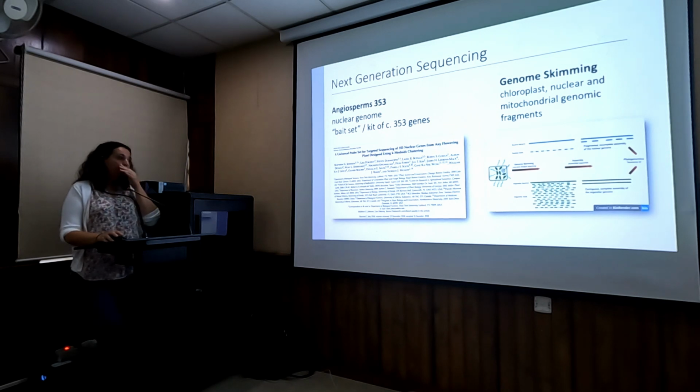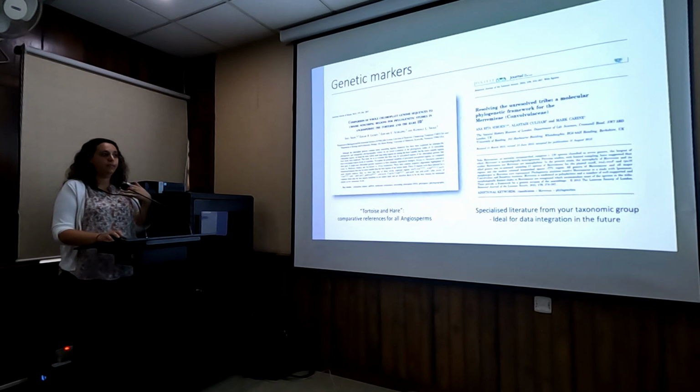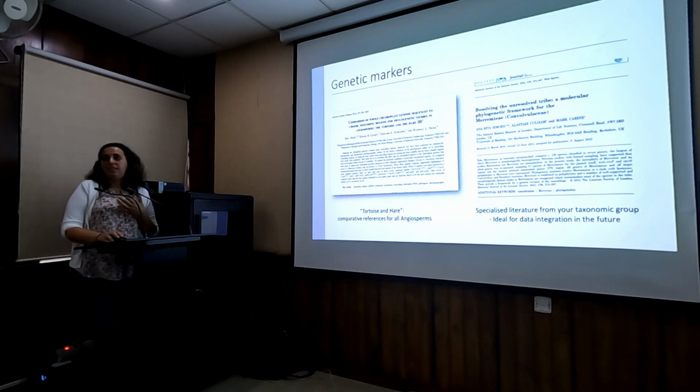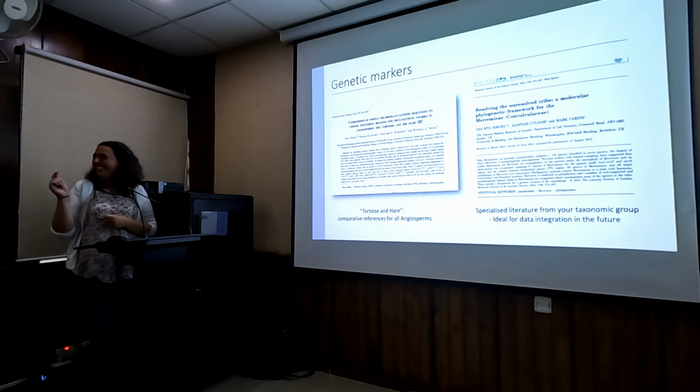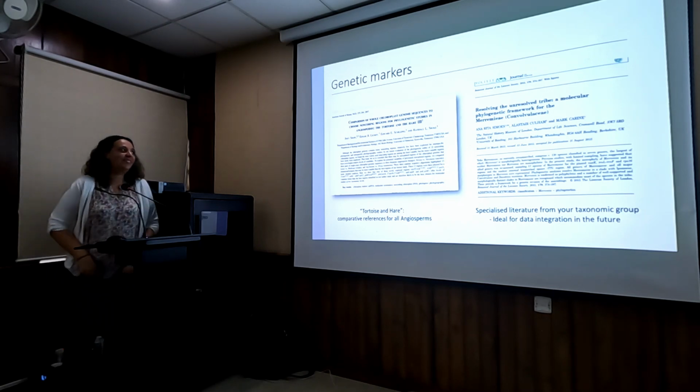Okay, so that was Sanger sequencing, which I think is our bread and butter, as they say, of taxonomists. I don't think we're going to go away completely from Sanger sequencing. It's cheap. It often gives us just enough for the kind of questions we're dealing with. Lars might disagree. Oh, he's quiet. Okay, he hasn't shouted at me yet for that one.